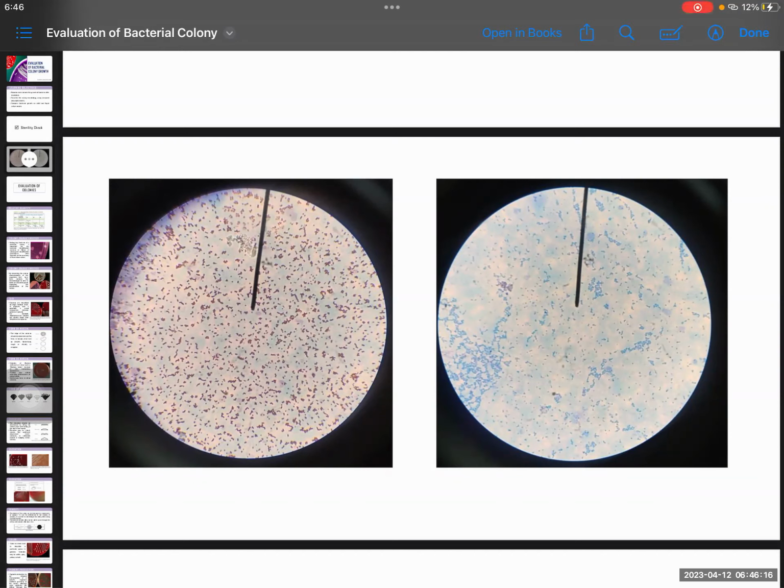But if it's on a non-sterile body fluid, especially urine or sputum, and there are multiple organisms present, like for example in your gram stain there's a gram negative organism, and you also observe multiple shapes, gram negative rods, gram positive rods, gram positive cocci, all of them, then that is most likely an indication that it is contaminated. So that's how we can check.